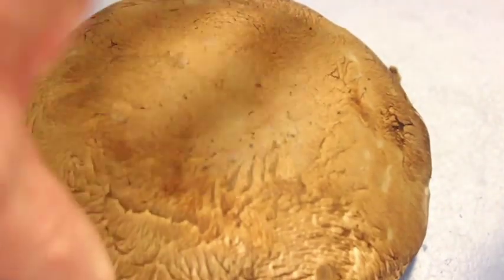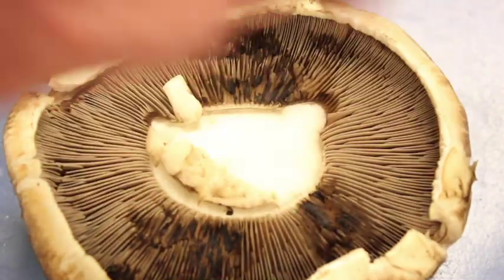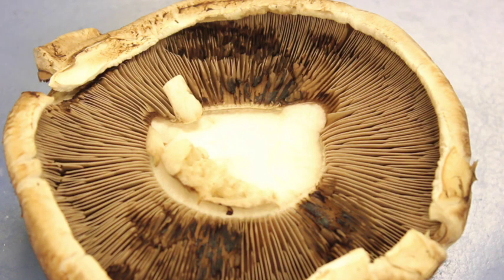So usually this mushroom then would be up in the air. We would have a stalk at the base of this, and it could release the spores. So all the spores are on these gills. It could release those spores out, and the spores are going to fly in the wind. So one way it's adapted is for the spores to fly in the wind.